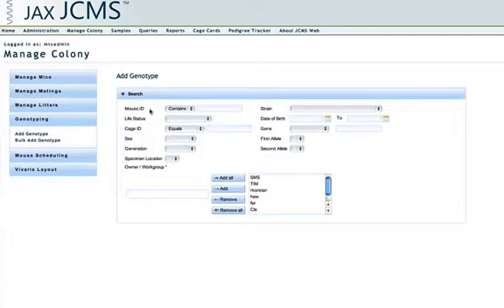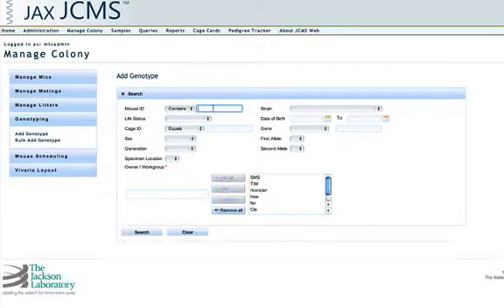Enter some search criteria. You can enter a mouse ID, strain, life status, date of birth, cage ID, gene, sex, first allele and second allele, generation, specimen location, and owner or work group.